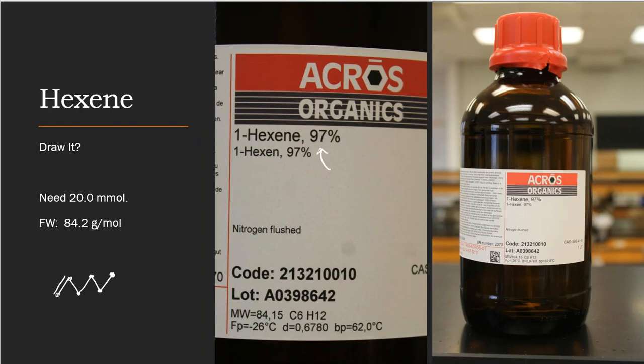97%, keep that in mind. Nothing's ever 100% perfect, okay? So 3% impurity. What is that impurity? Who knows? But 1-hexene, 97% pure. All right, so I need 20 millimoles. It's not a big deal. So I'll do this very similar to what I did before, right? We'll practice. Practice makes perfect.